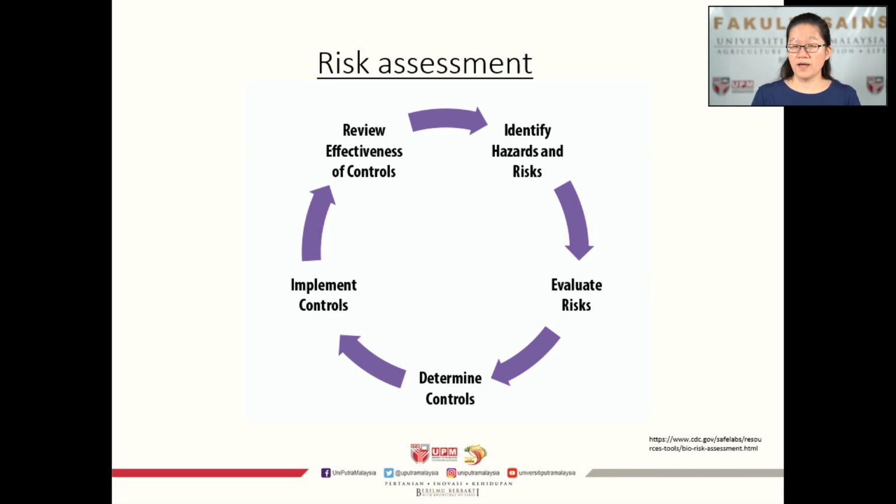Risk assessment is the backbone of biosafety. It is a continuous process to identify, assess, control and monitor risks. It must be assessed by professionals who have been given proper training and exposure. There are 5 main components involved in the risk assessment process, which are to identify hazards and risks, to evaluate the risks, to determine controls, to implement controls, and to review the effectiveness of the controls. And if the controls are not effective, then the cycle will repeat to improve the control measures.